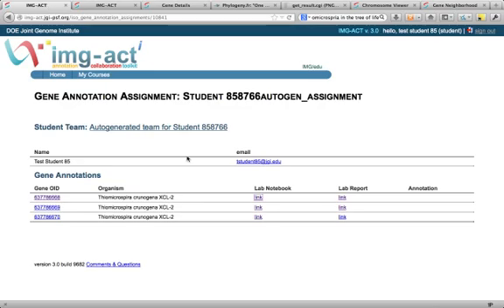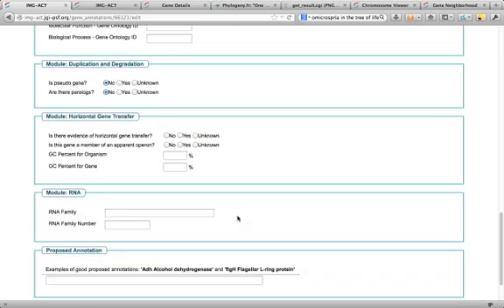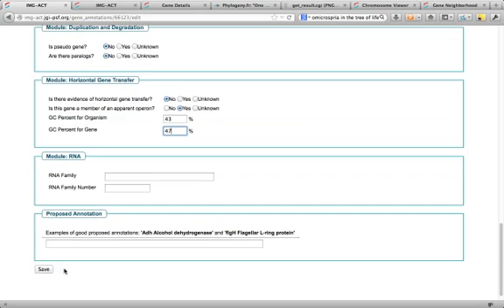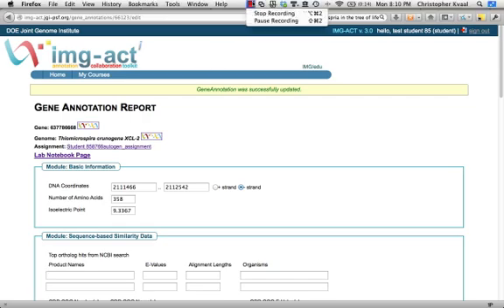We'll save this and call this done for that particular assignment. Going back to the lab report — is there evidence of horizontal gene transfer? No. Is this gene a member of a parent operon? Yes. What's the GC percent of the organism? 43. What's the GC percent for the gene? 47. I'm going to save that and we're done.